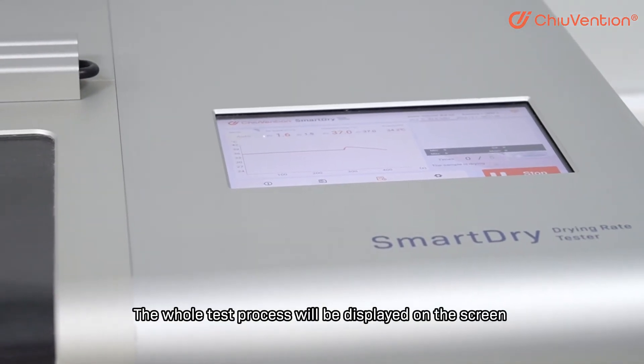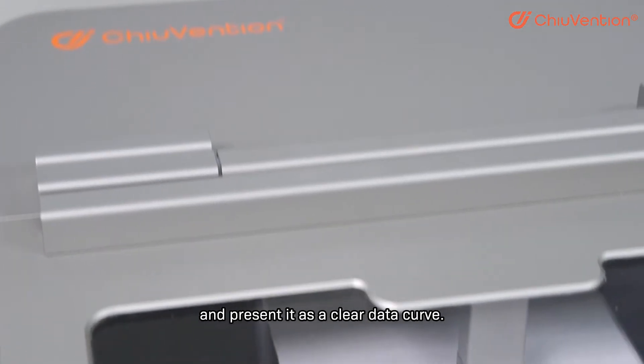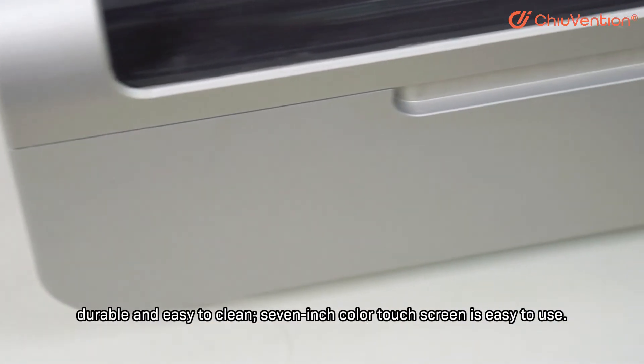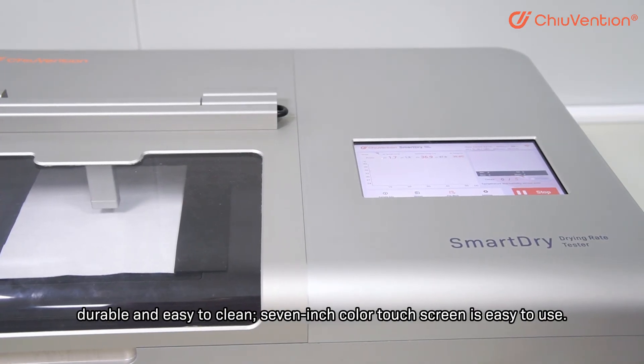The whole test process is displayed on the screen as a clear data curve. The precise appearance design features an aluminum alloy hard oxidation surface that is durable and easy to clean. The 7-inch color touch screen makes it simple and easy to use.